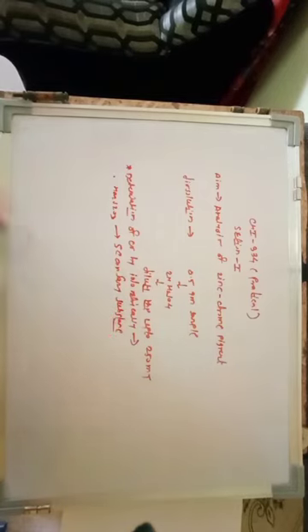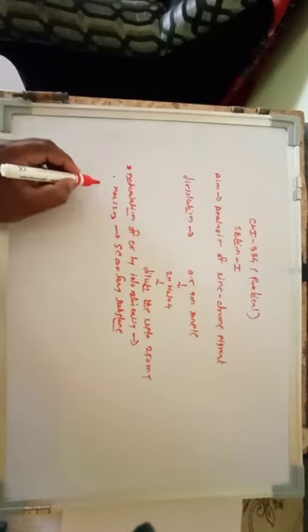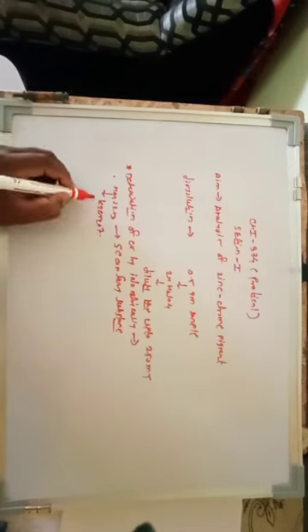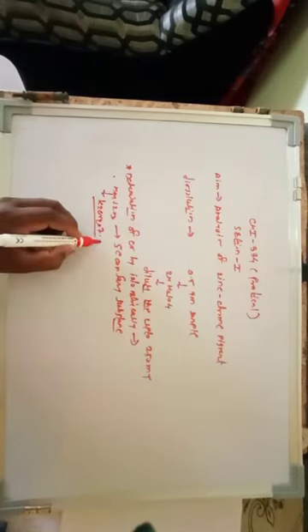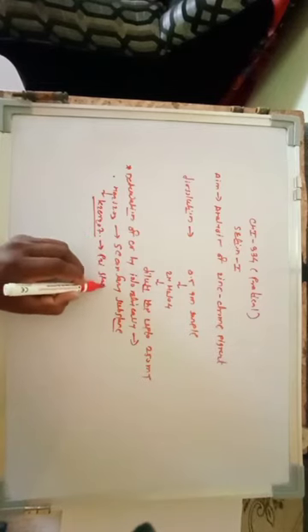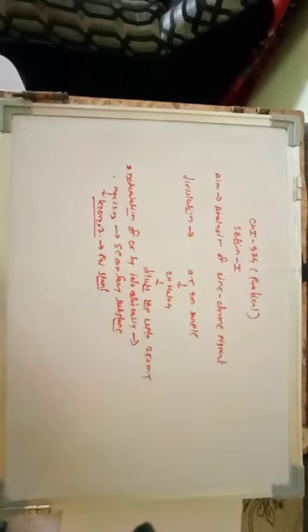So before titration, you have to find out its exact concentration by titrating with a primary standard such as potassium dichromate, K2Cr2O7, using starch as an indicator. Whenever you use Na2S2O3, keep in mind that it is a secondary standard.